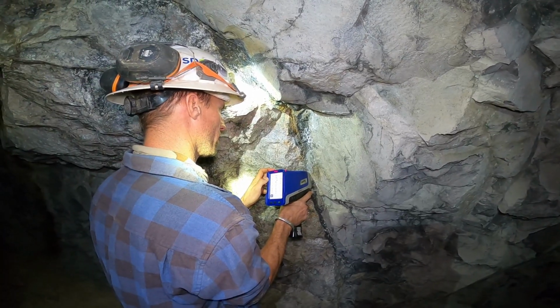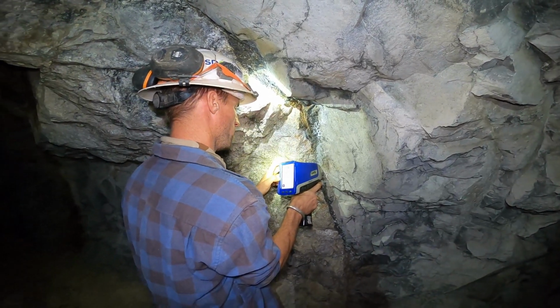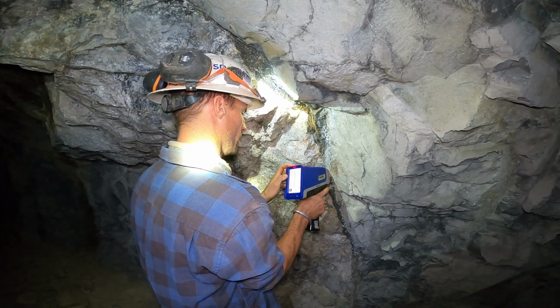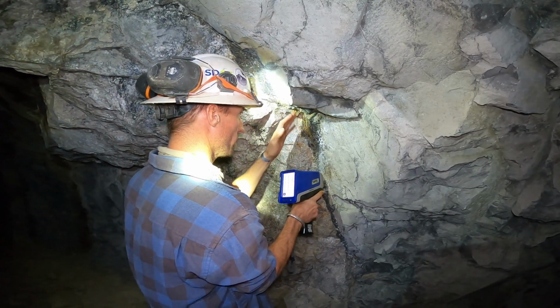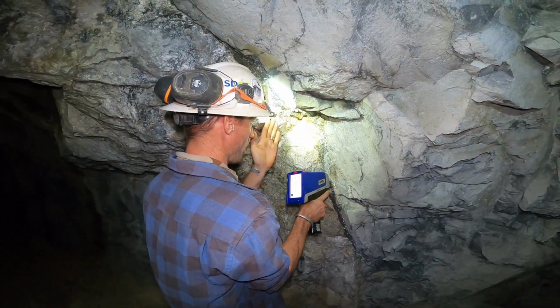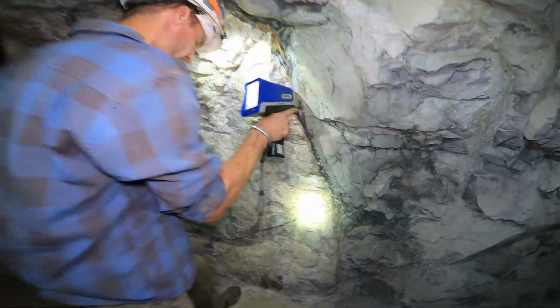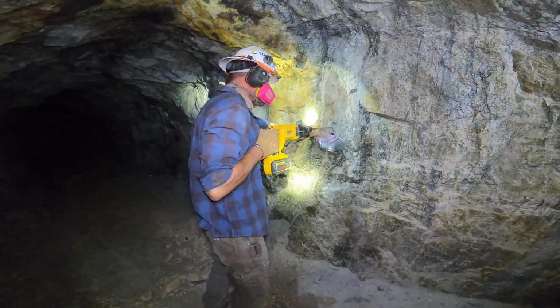Calcium's at 18%, so that definitely is a calcium. Cerium showed up, and then dropped it. Oh, it's back. What's neodymium? 420. Okay, so it's still in that. So this little offshoot carried it. Which, look, it's actually a contact. Yeah, here's the dike. You got 2 different rocks on either side.